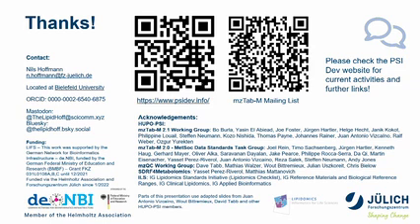One of the concerns I've had of late, going back looking at the data we store, is that the data is stored in a coded form by the mass spectrometers. How that data comes out into a form that we can use in different programs is a point of variation. I found that if you take a raw set of data and convert it into different formats and then look at it in one of our software, we often end up with different answers because peaks get split, zeros get inserted in different places where they shouldn't be. Can we do something to address this? Because I think if you put bad data down, then you're going to get bad data interpretation.